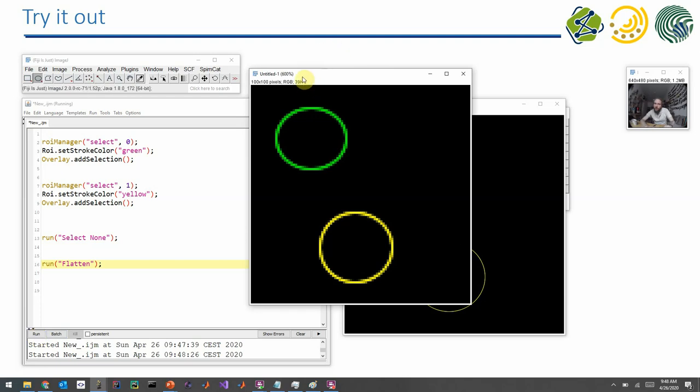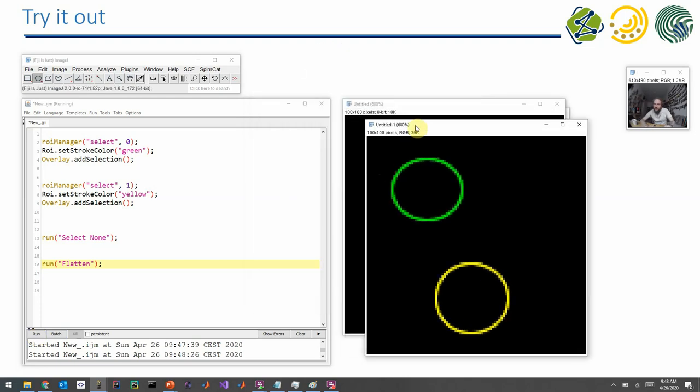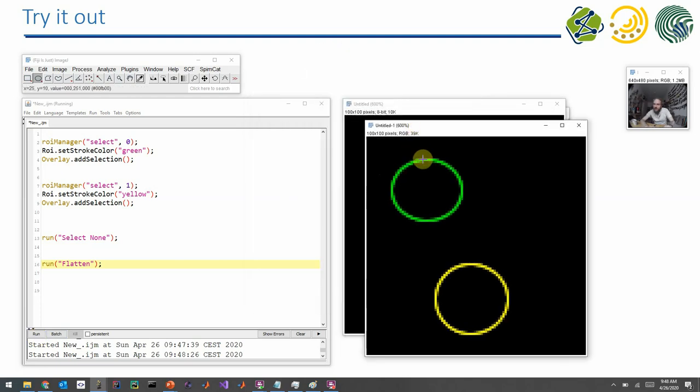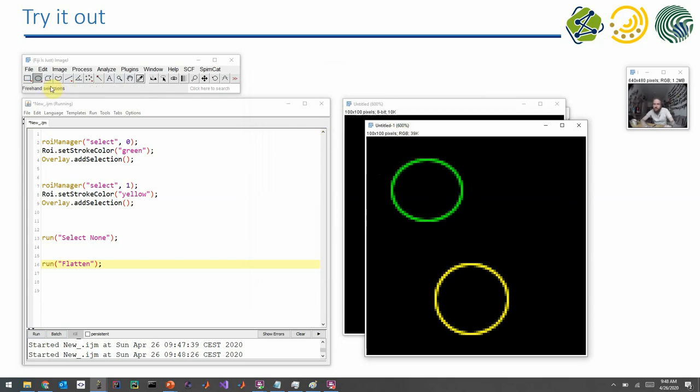Also, this was an 8-bit image. This is now an RGB image. And when I move in here, you see that the value in the main window highlighted changed. And also, it's three values, right? It's the red, the green, and the blue. That's what RGB here says.